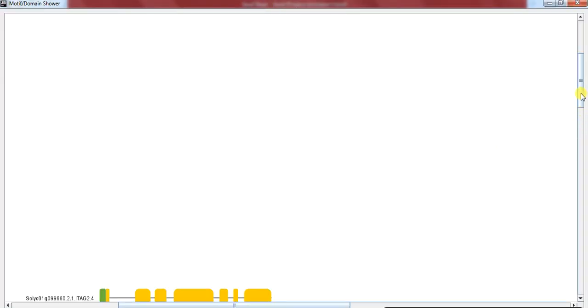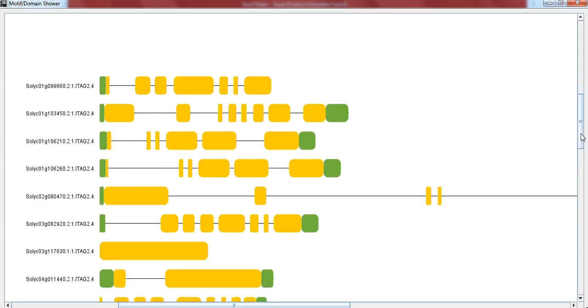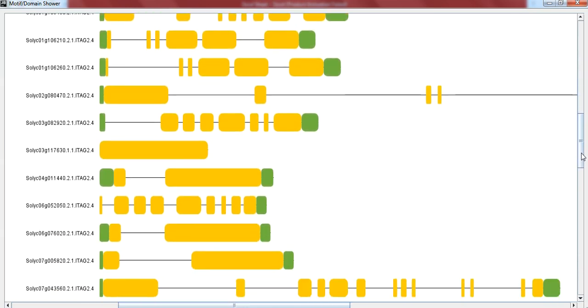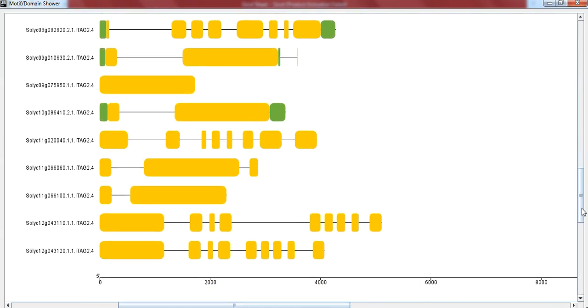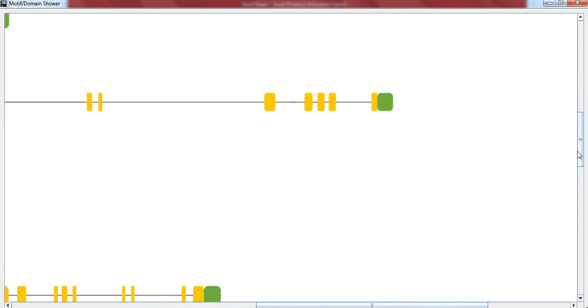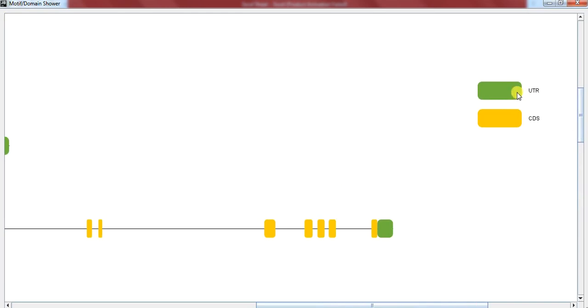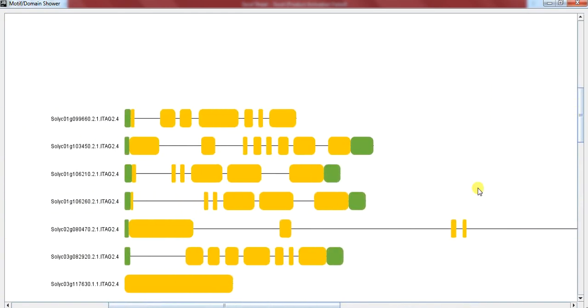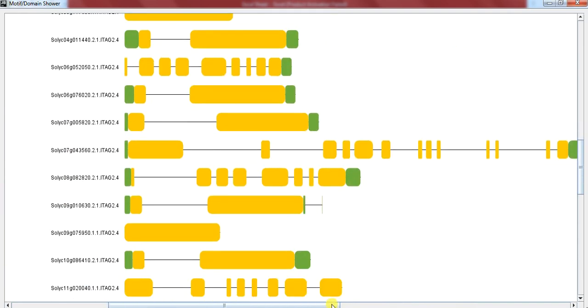So we have got this exon intron figure. Here the green one, the yellow one are the CDS or coding sequences.